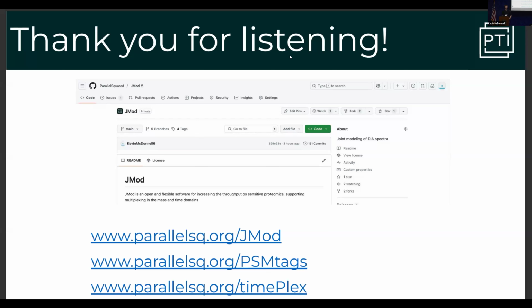So thank you. I have a technical question. Because there's a difference due to mass defect between the isotopes of carbon and nitrogen, as we know from TMT, is it possible with high enough resolution to split the MS1 peaks into doublets and then double the multiplexing this way? This is something we're looking into, exactly that. So actually taking advantage of that mass defect. And so, yeah, having them, I guess, offset by millidaltons as well as overlapping. And so you can, theoretically, if you introduce, say, enough nitrogens into your molecule, you can do this.